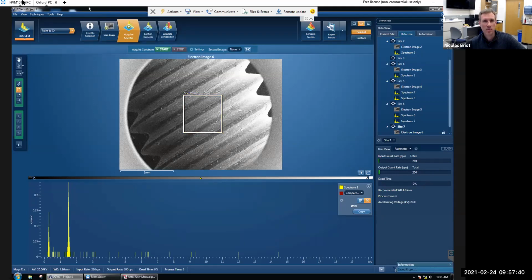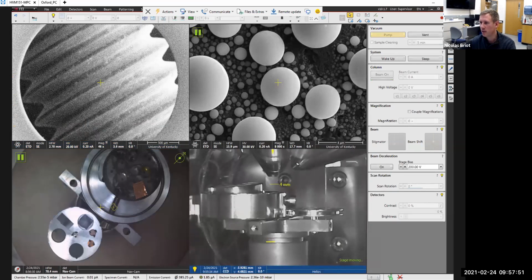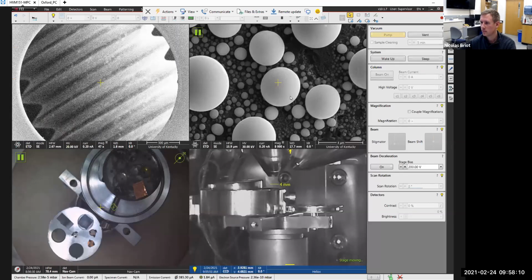See, that's why, let me share the microscope. That's why it's recommended to work at 4 millimeters. Now this screw, I'm focusing at 10 now. So let me bring it up. I want to make sure I don't collide with anything, of course. So I'm going slowly. Go a little faster. So I'm moving the stage up. You can see. It's about as high as I can go.